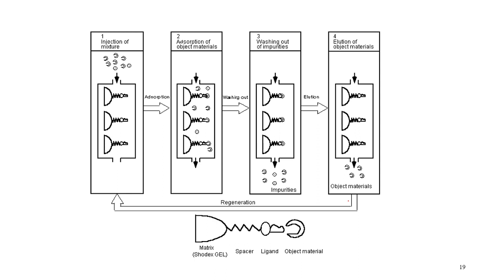So what is happening? There comes the concept of tighter binding: the compound that binds more tightly is relevant over here. First, you have a particular ligand that binds to your target material, and there you do not have any competition for the binding. Then in the end, when you are eluting your material, there comes the concept of competitiveness.